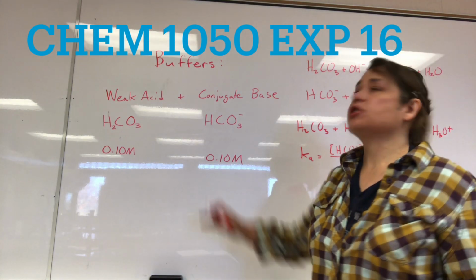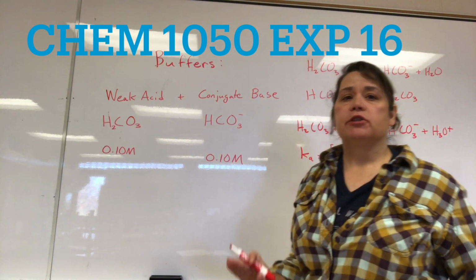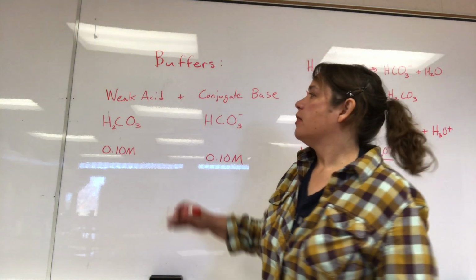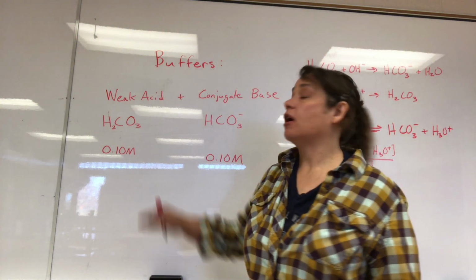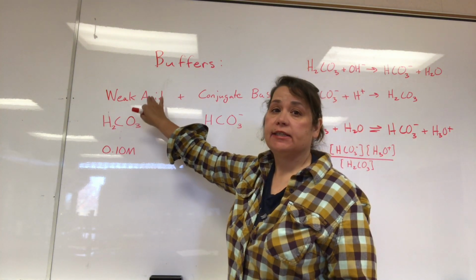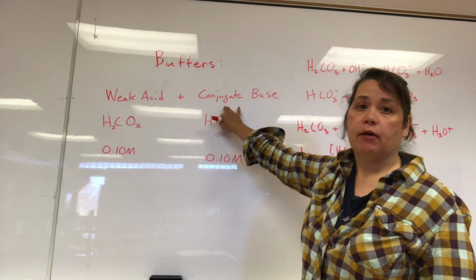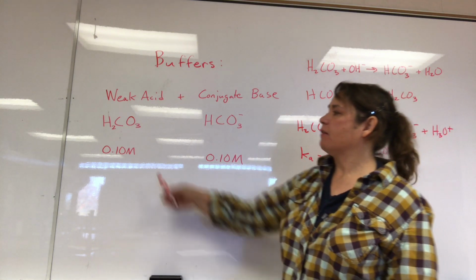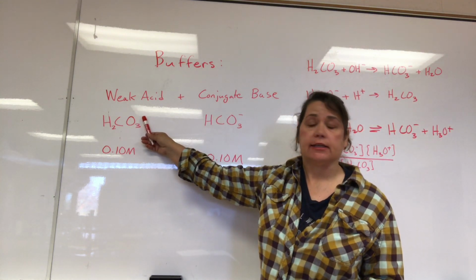Our lab today is concerning buffers. Buffers are solutions that are made by preparing a solution that contains significant amounts of a weak acid in the same solution as significant amounts of its conjugate base. So for example, here I have the weak acid carbonic acid.